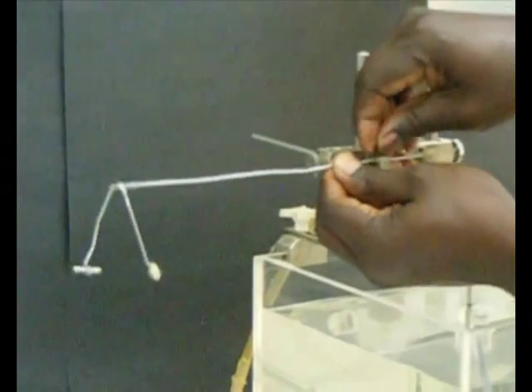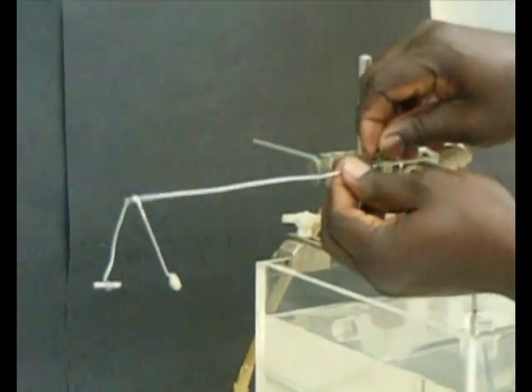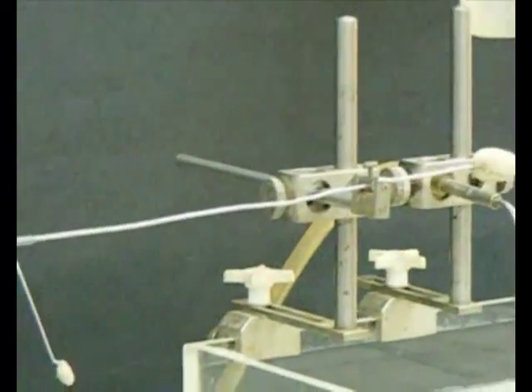Balancing the writing lever. It is ensured that the writing lever is balanced with approximately one-fifth of the length of the lever on the plasticine end and four-fifths on the writing pen end.